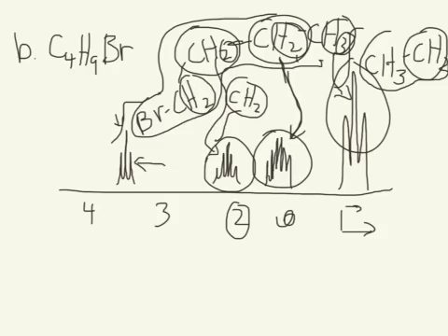And then we assigned this CH2 to be that signal. It's a little bit more downfield than usual because it's pretty close to that bromine. And it has 5 peaks because there are 1, 2, 3, 4 hydrogen neighbors. So that makes sense. And then this guy, the CH2, is pulled way downfield by the bromine. It only has 2 hydrogen neighbors, so there is 1 more than 2 peaks, 3 peaks. It all is falling into place.